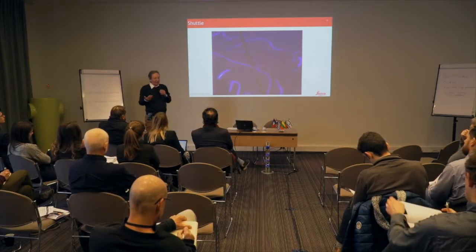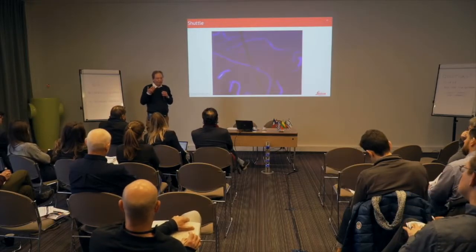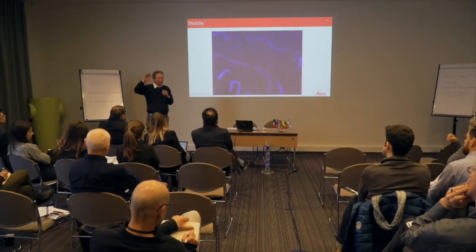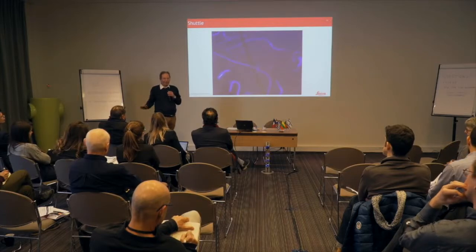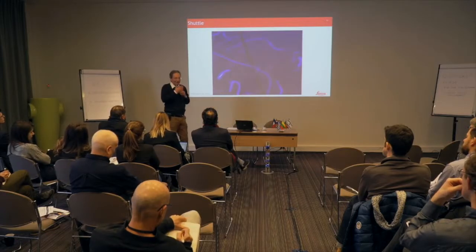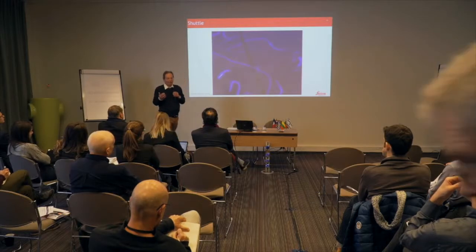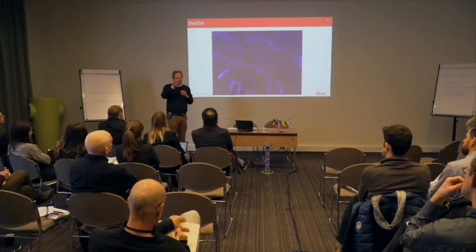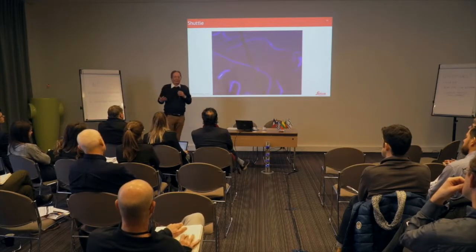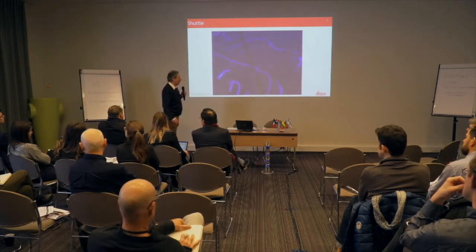And we will very likely run into a very, very huge amount of data, which then is for whoever will take care of the database part. Because I can tell you that these dimensions of databases we will not be able to handle. This is not a miracle. We discussed that, Tomáš and I, yesterday. This is really huge data handling, which is beyond what we normally have in a microscope.